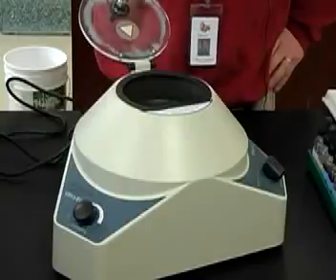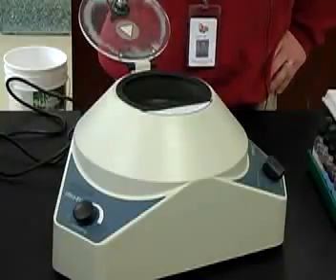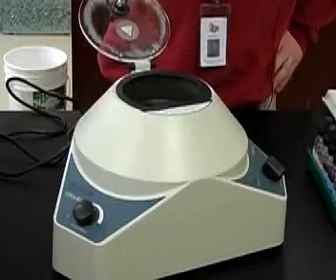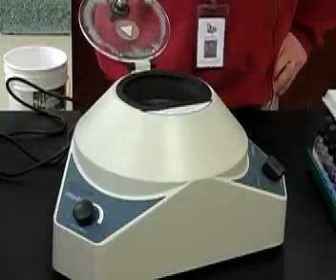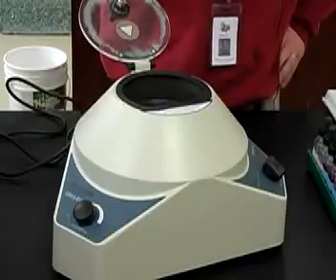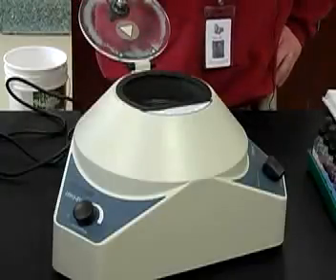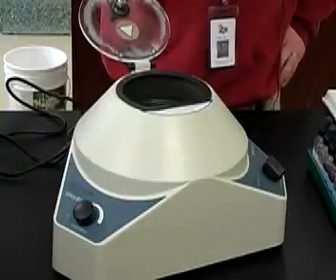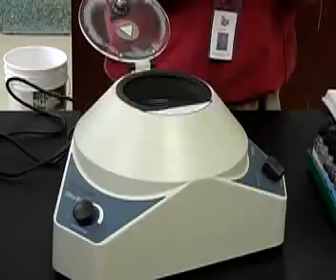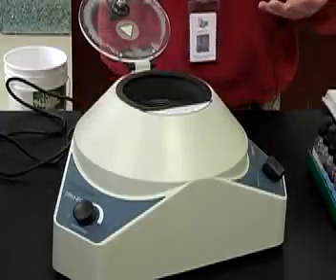First of all, it's not real safe, because what happens if you catch your finger on one of the test tubes? Second of all, it might not allow your solution or your solid to settle out quite as nicely as it should, and so then all the centrifuging that you did to get your precipitate to the bottom of your test tube is kind of wasted.